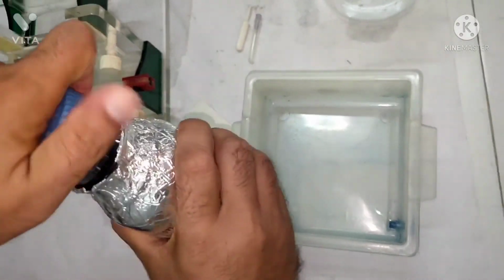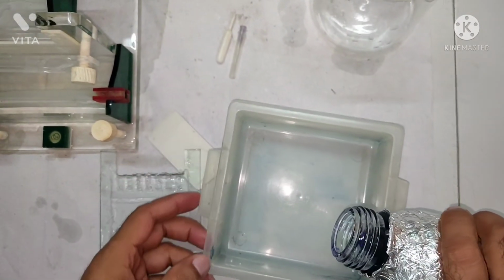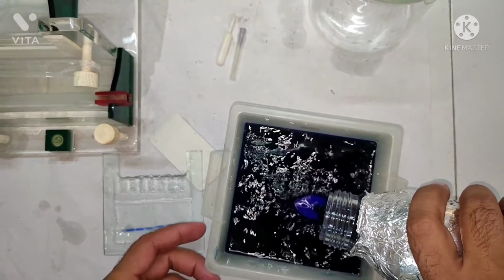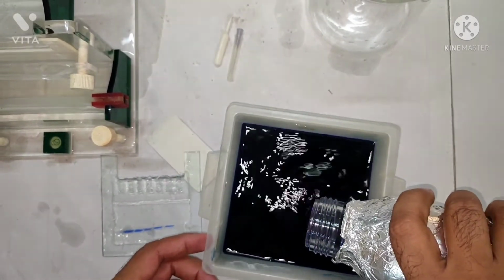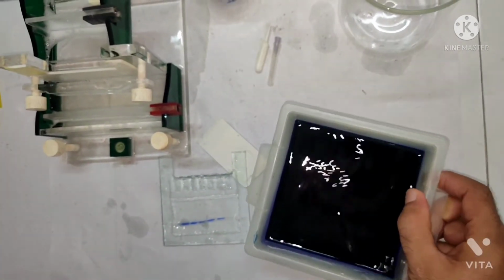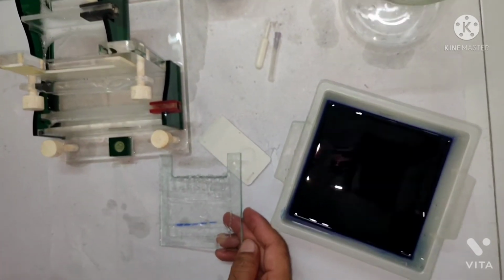And you put the staining solution inside any such box. Okay, so now I am putting this staining solution, and before that you can wash also, right? So I need one more plate so that I can wash it. Otherwise I can wash.